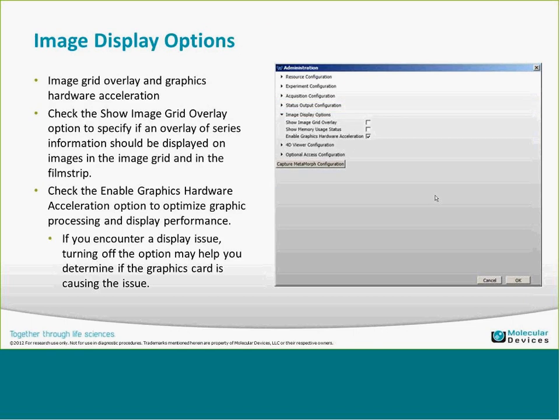The image display options include checkboxes for the image grid overlay and memory usage statistics. There's also the option to enable graphic hardware acceleration — if you have a decent graphics card, I'd highly recommend checking that box so it utilizes the card to the best of its ability.